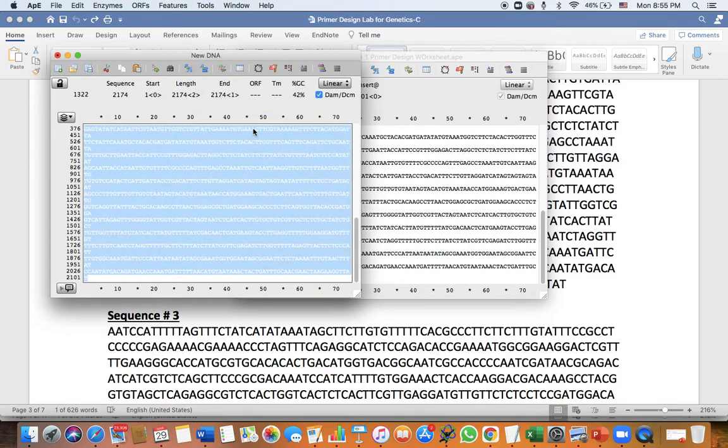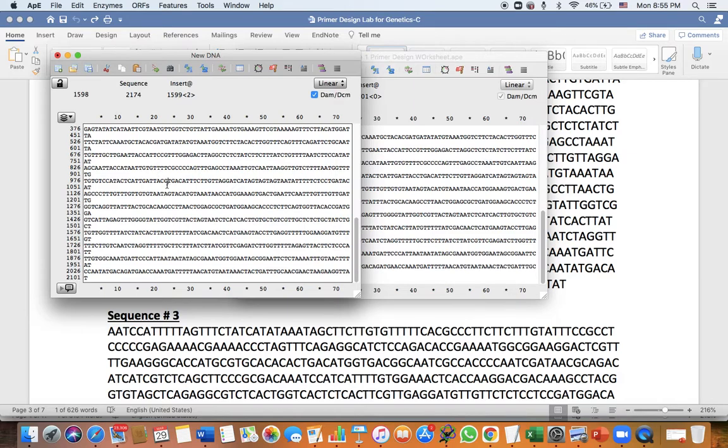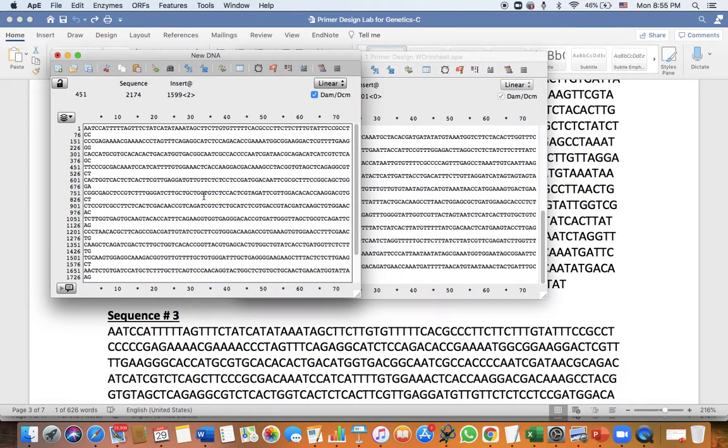Now sequences like this could easily be copied from NCBI, but here I provided you the sequence of the RAC1 gene from Arabidopsis thaliana. Alternatively, to find out which of these genes have a possible insertion or deletion, I could copy these sequences and paste them into NCBI BLAST, and you could see the differences between the genomic DNA and the actual sequence, and tell which gene sequence has the insertion or the deletion. But we're going to do this using APE today.